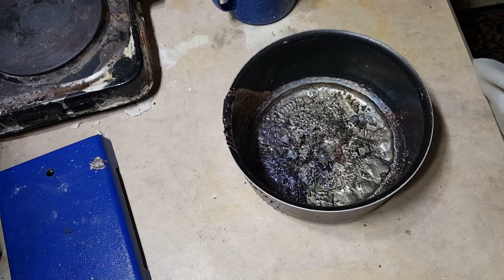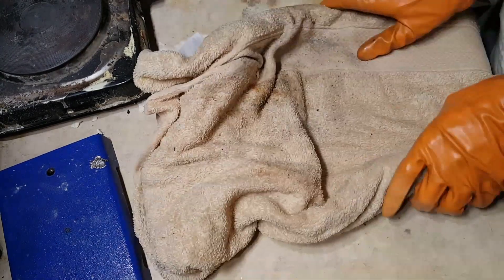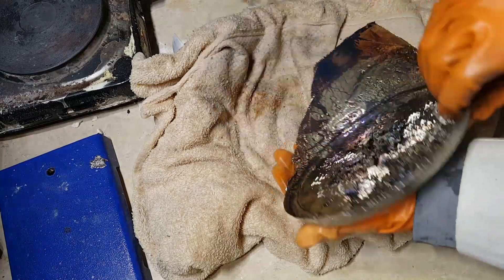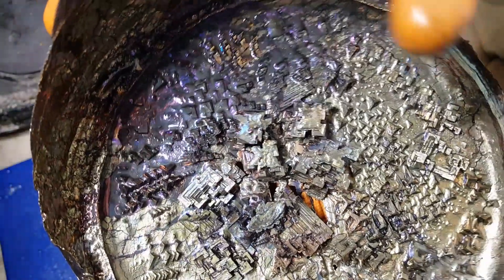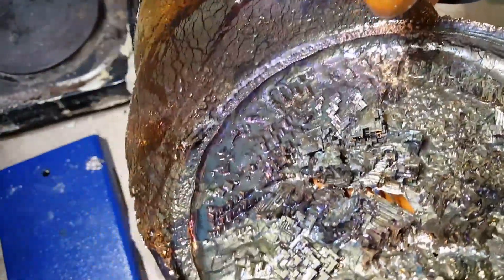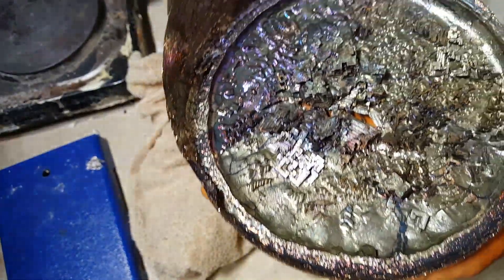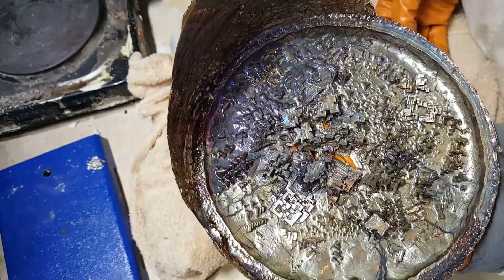I've cooled the crystals off now, and all you need to do is turn it upside down and snap the crystals out. Look at these — these are really nice crystals. The crystals have quickly coated themselves in the characteristically colorful bismuth oxide layer. Bismuth is pretty brittle compared to most metals, so you can easily snap crystals off and give them to your friends.